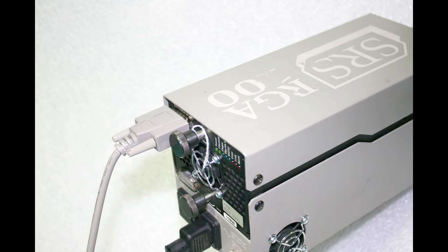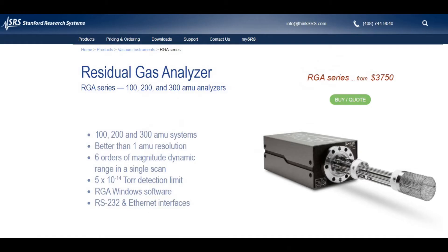I'm going to use an SRS100 RGA in the helium leak check mode along with some helium gas to locate the vacuum leak. Helium is used for leak checking because it's a noble gas and it also has a very small molecule.